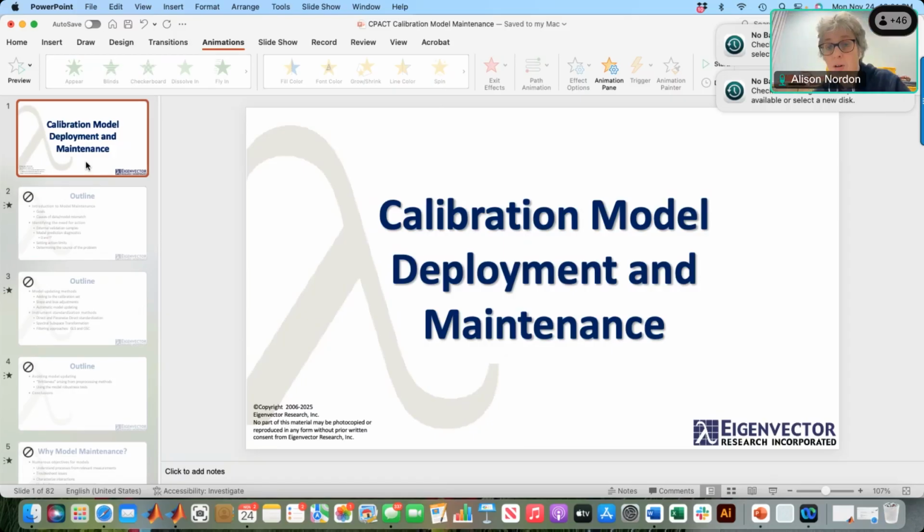Okay, thank you. We've got a question from David Lovett. Do you often use soft sensors to act as a backup to the measurement from the analytical instrument? For example, for powder moisture, what happens if the signal drifts or fails the monitoring test during a production run?